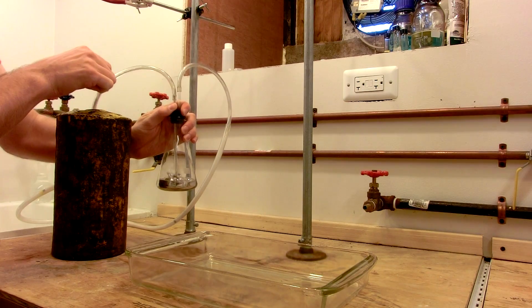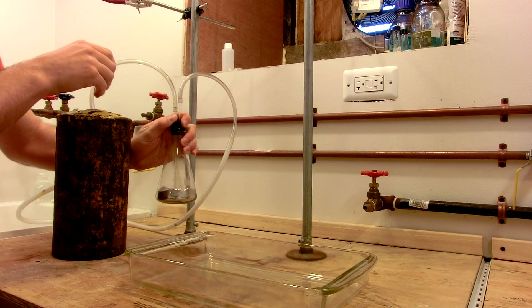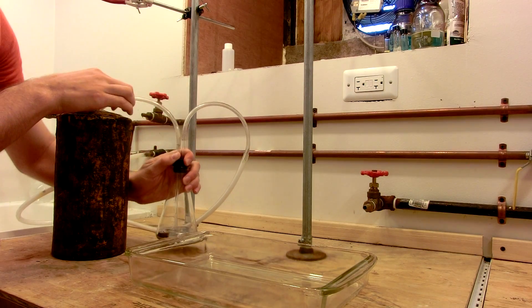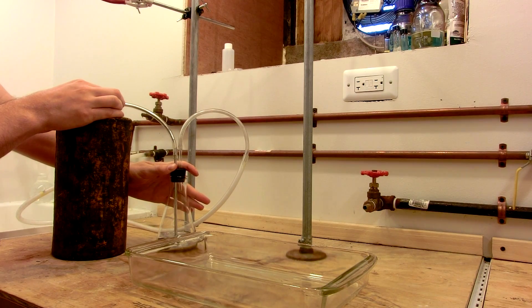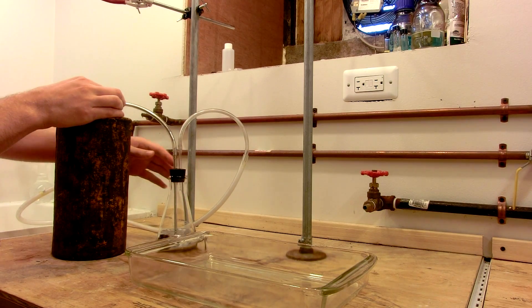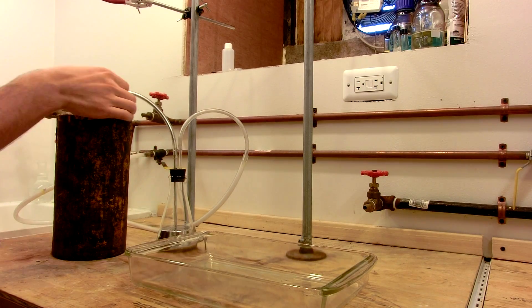And that's liquid mercury filling up this flask. It's very heavy. I'm going to put the flask down so I don't want the bottom to fall out of it. That there is about six or seven pounds of mercury. So I'll turn the vacuum off.